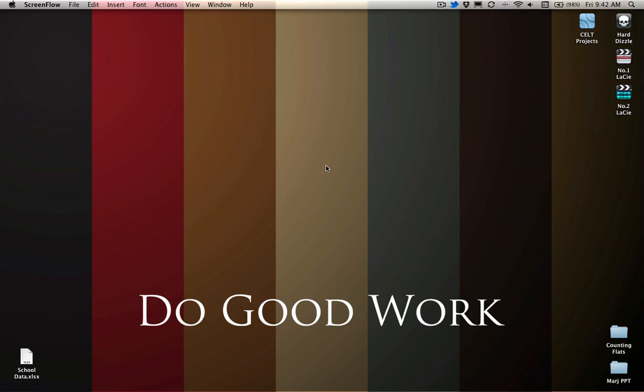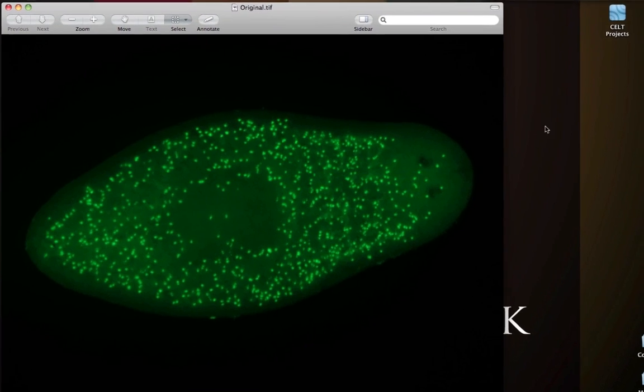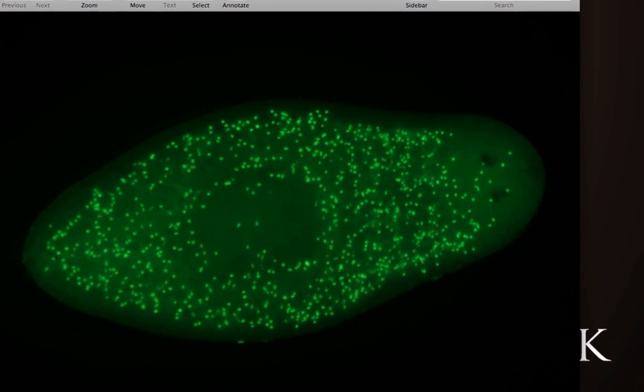So for those of you that haven't worked with ImageJ before, it's a lovely piece of free software that will help you do a lot of image editing. And what we want to do today specifically is we want to work on how we can count all of the cells that are fluorescing in an image like this one right here.